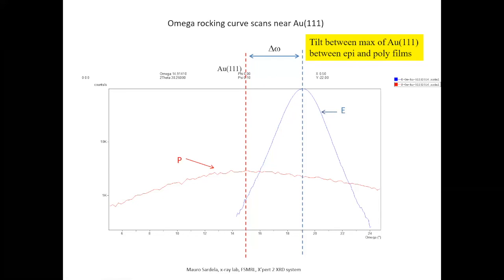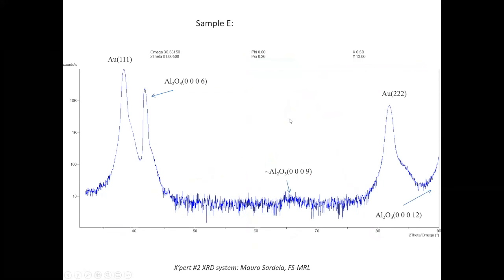For the polycrystalline, once we did the scan after the alignment, you can see here that the peaks that were missing originally, the 222 and 311, start showing up. Very clear here, proving that the sample is polycrystalline.